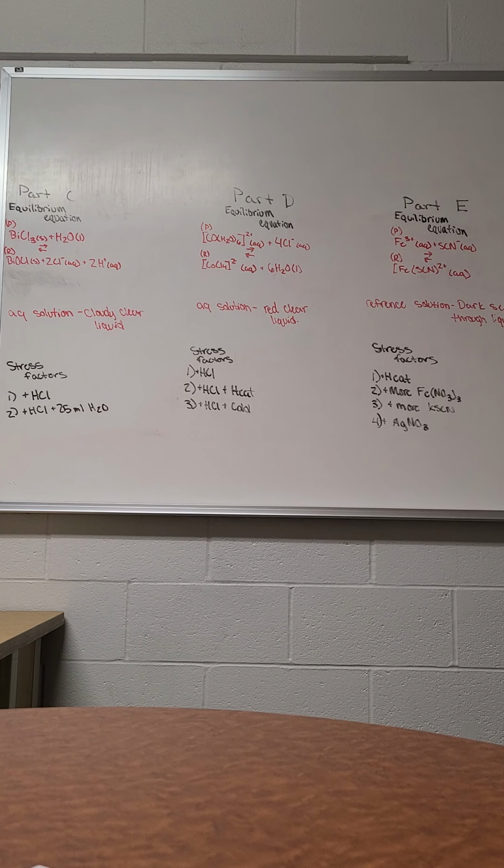Now, one thing to note is all of these stress factors, based on how I have them written on the board, you could think they were added together. So HCl was first added to the aqueous solution, and then more HCl and water was added to the aqueous solution in part C. That is not the case. All of these stress factors were added completely and totally individually to the aqueous solution.